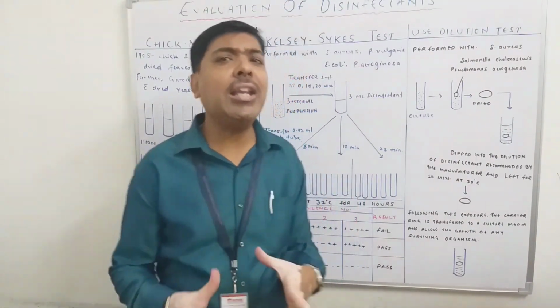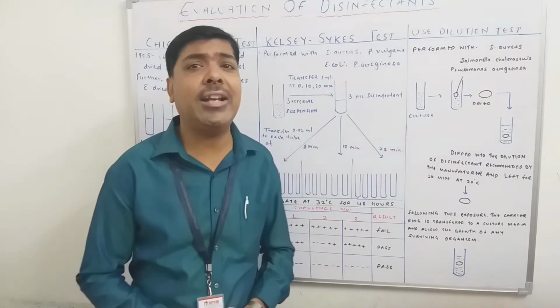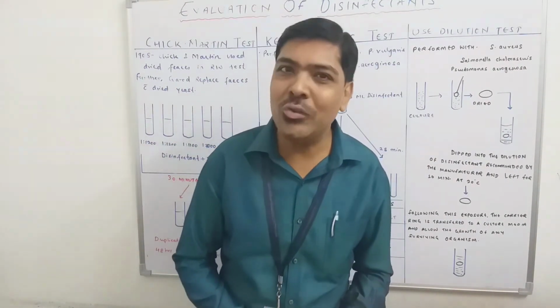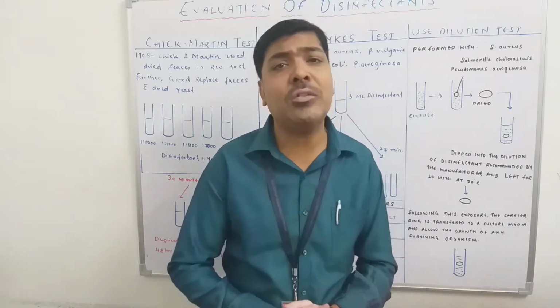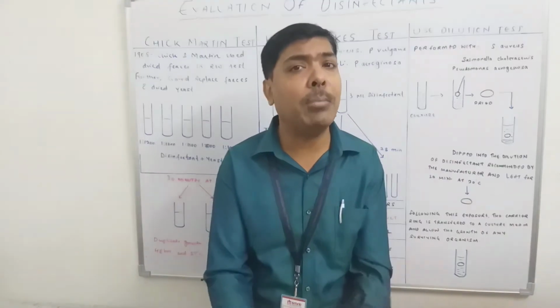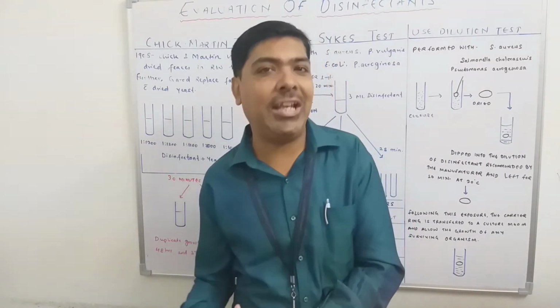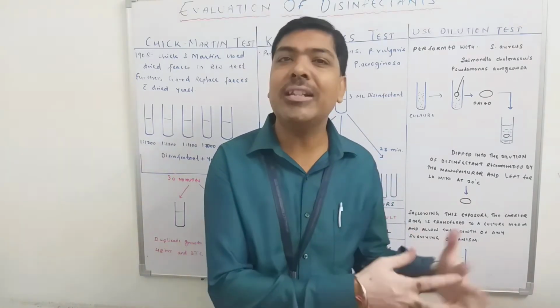Okay, this is again a very simple test. As you can see in this diagram, you can easily understand what has to be done in the use dilution test. But the principle is very clear why we are performing this test, because every manufacturer, while launching a particular disinfectant, always claims that for this particular disinfectant, this much dilution is necessary.